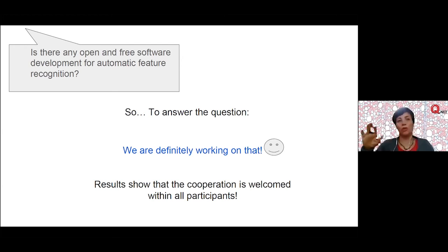Okay, super. So could you give basically a range between the worst quality and the best one that you can have? Well, you can easily scan, if you just want to use it as some kind of tomography for anatomy, for instance, you want to have a quick view on the internal anatomy. Maybe you can do a very, very fast scan at 10 micron resolution, and then in 5 to 10 minutes you could do your virtual slicing, and you could have a fast look at the data.